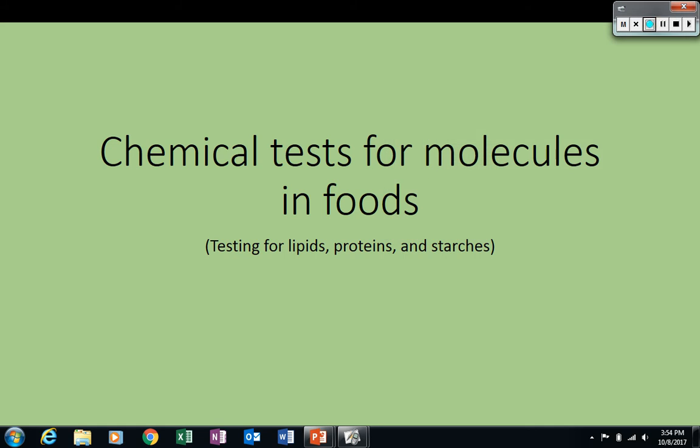So I'm going to teach you how to use different chemicals to test for different molecules in foods. And the molecules you're going to be testing for are lipids or fats, proteins, and starches. So we're actually going to bring different foods into the classroom for you to test to see which molecules are in which foods, to give you a better sense of what we're getting out of the foods we eat. And by now you should have a little sense of how those foods break down in your body, but we're going to be looking more at that in the coming days.